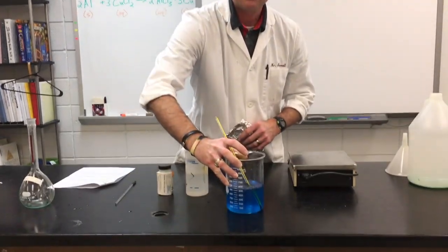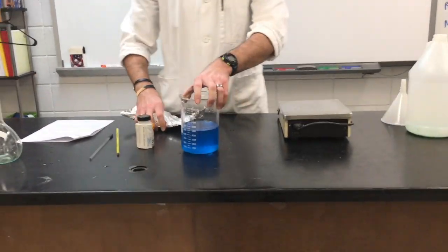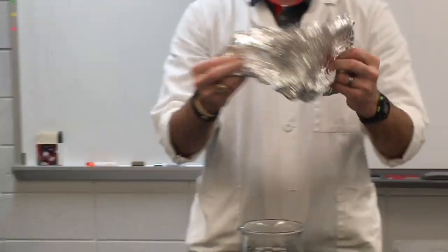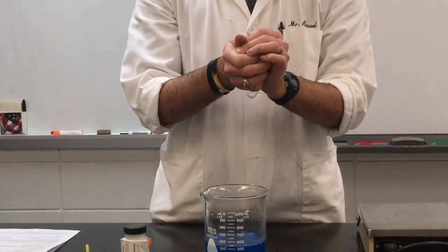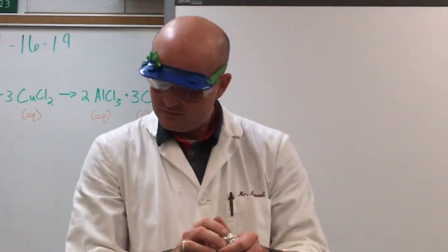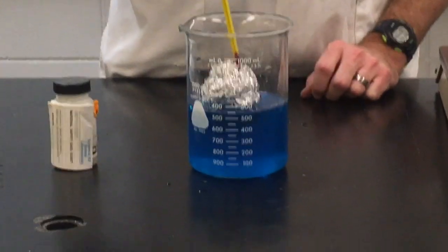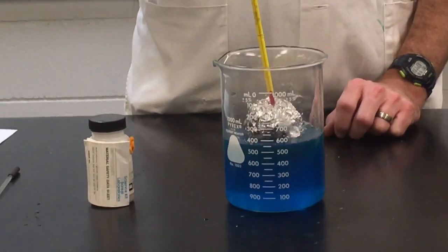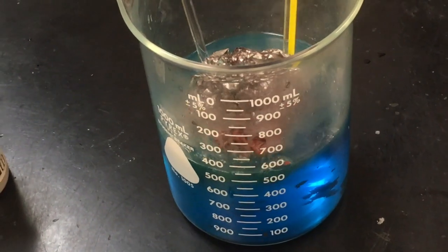Next part is the fun part. We're going to take the thermometer out. My lab coat will give you a nice clear picture. We're going to crumple this aluminum foil into a loose ball — a nice loose ball. Hopefully we're making observations right now. Then we'll just place it into the copper chloride. Let's see if we can really get it going.